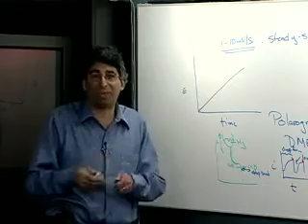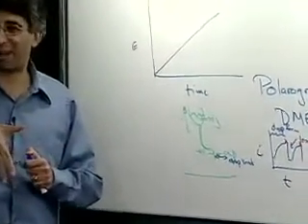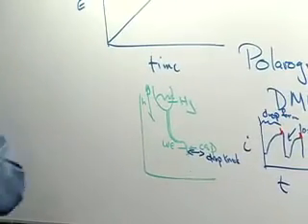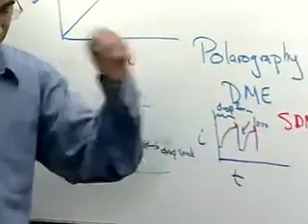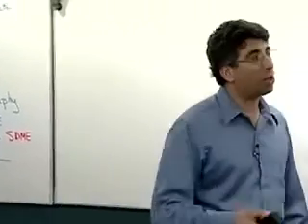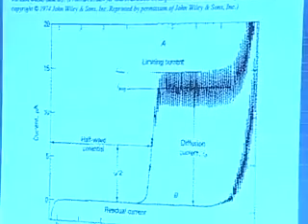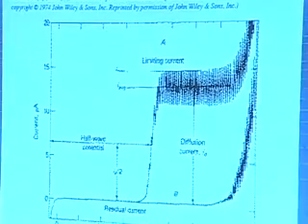And as long as you pick a time frame that is faster than the natural falling off rate of the drop, you're in great shape. And now you get a very good reproducibility, and you can do things like sampled polarography. That now opens up another possibility. On the one hand, this jiggly current is painful. On the other hand, it's useful in that the current here is larger than you would get if you didn't have that mercury drop going in there and stirring up things and changing the diffusion layer. So you're actually enhancing the current.